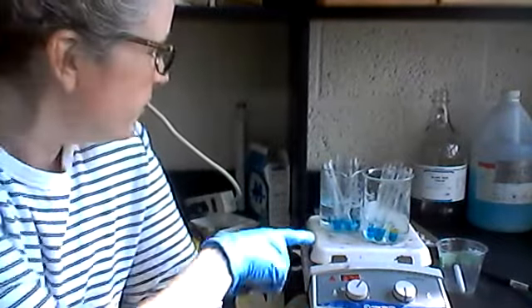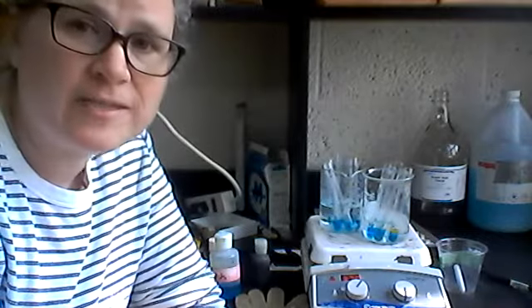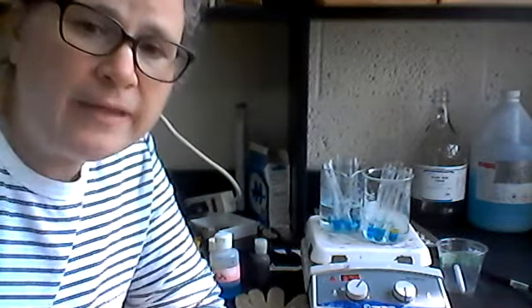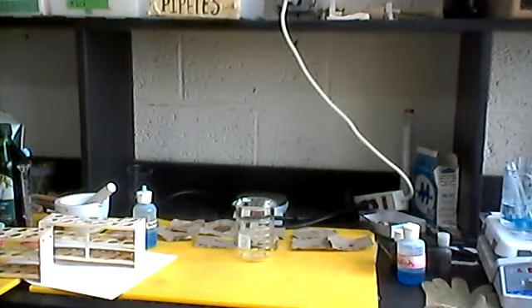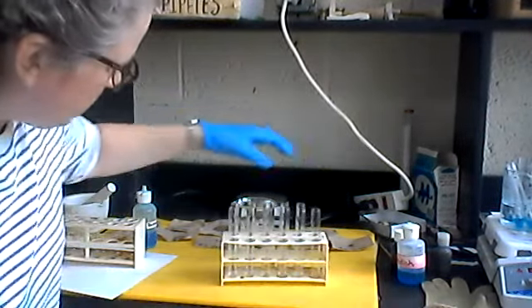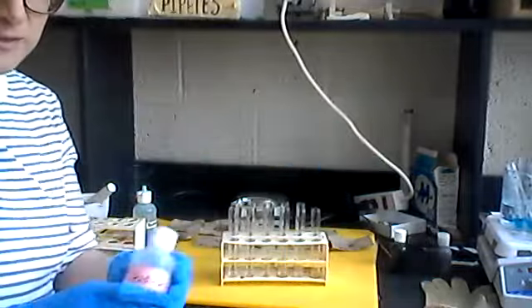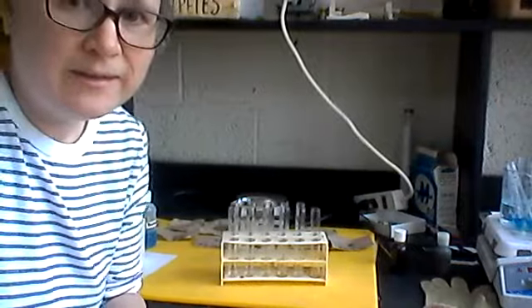Okay, so I just put all of Barfoed's reagent into this boiling water bath, and like I said, they'll go for 10 minutes. In the meantime, I'm going to set up the Benedict's reagent, and it's going to be very similar, almost the exact same thing. I've got all of my different substances loaded up into the test tubes there. And I'm going to just add Benedict's reagent this time. So I'll add that, and I'll show you that in a moment.